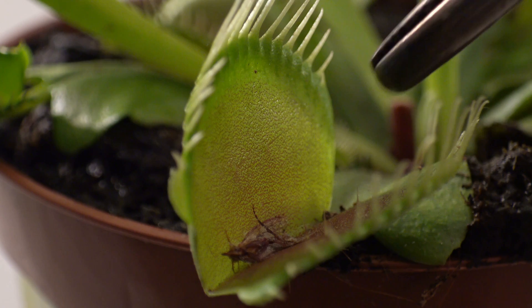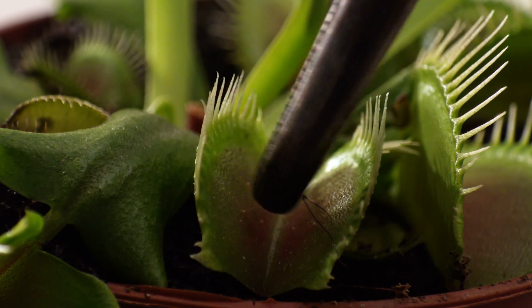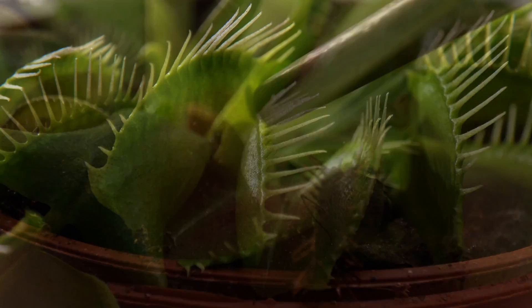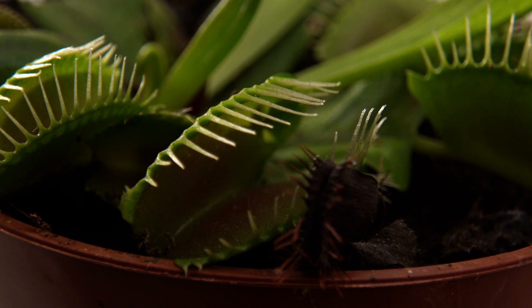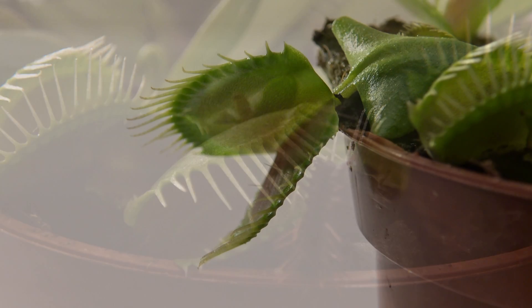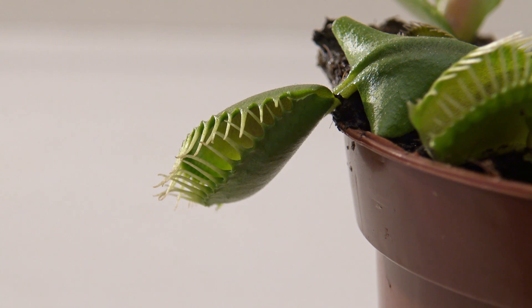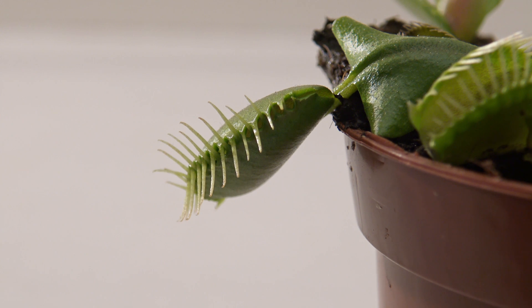It became even more interesting when testing the other leaves. On the next leaf, only one of the trigger hairs did react, causing only a part of the leaf to move. This leaf did almost react as usual. It was obvious that the ether didn't spread out evenly, which was actually more interesting in my opinion.